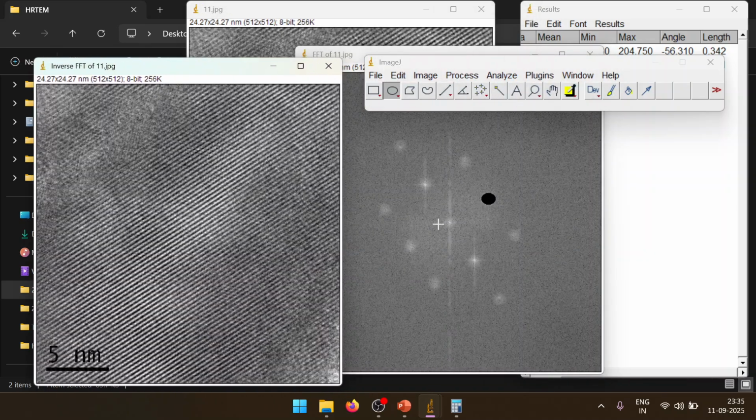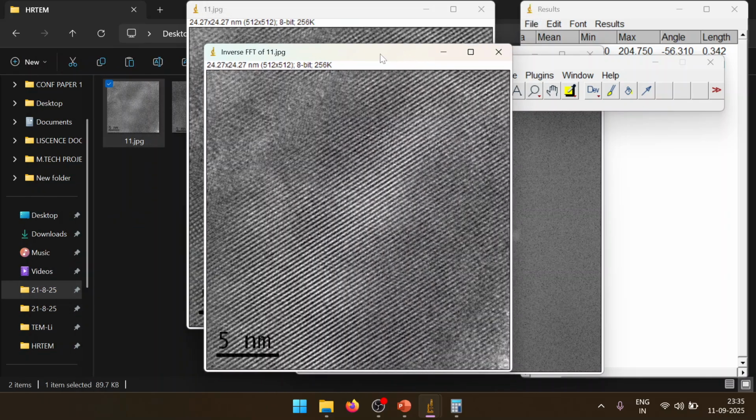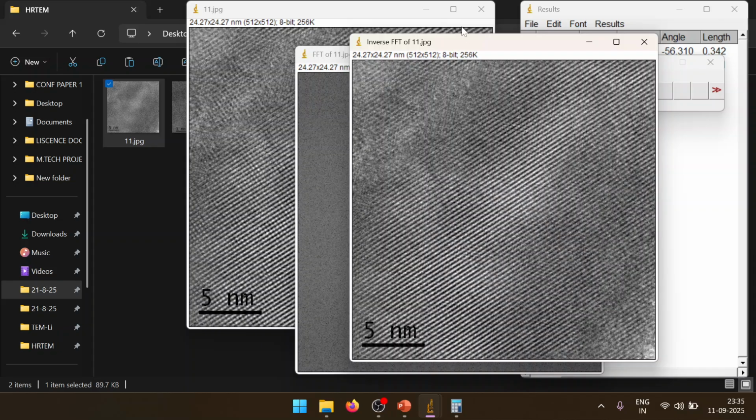So you can see here, this corresponds to that. You can do either this or this. Both of them are opposite, and then the same, you just have your z component as negative one. So these are the same family of planes, just one of them is different, either x, y, or z. Anyways, we got this inverse FFT and we got our planes of interest.